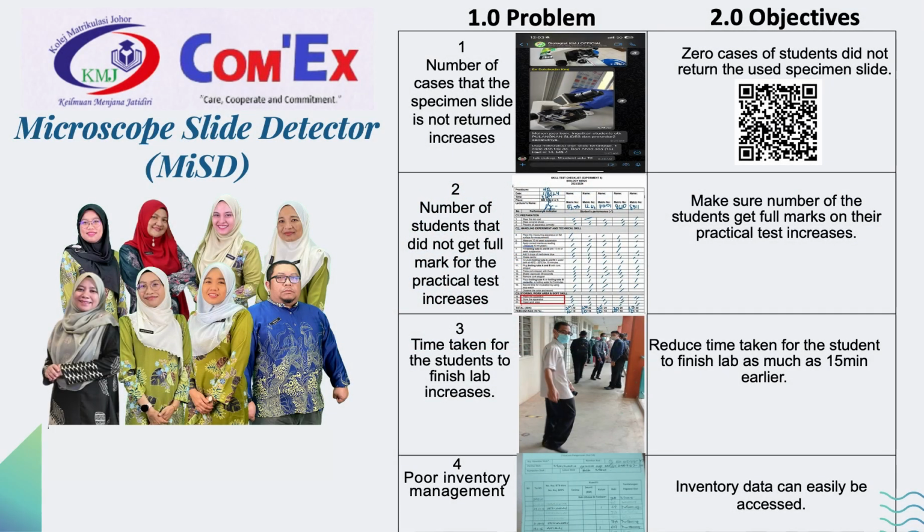I am Mulyani representing my group ComX from Kolej Matrikulasi Johor. We will present our innovation project titled MISD, a microscope slide detector. What is MISD? MISD is basically a system that uses the basis of RFID in helping lecturers with inventory monitoring during a practical session. MISD consists of a tag and a reader, just like RFID.